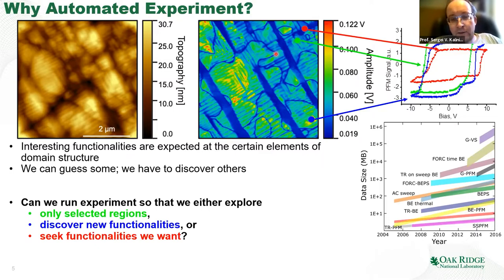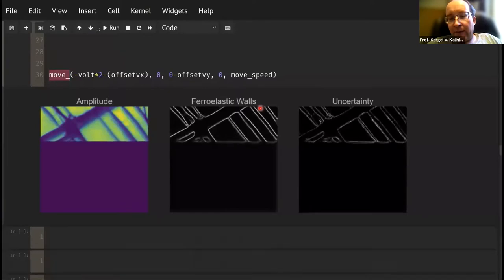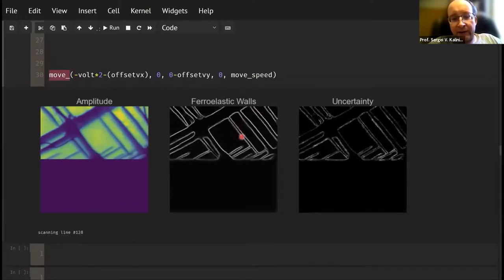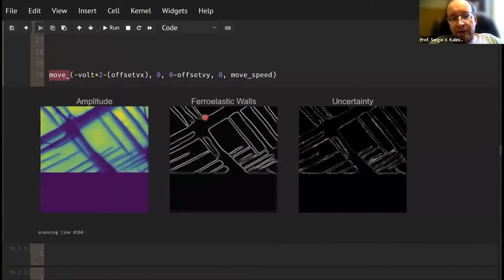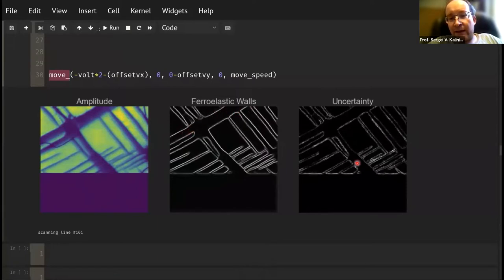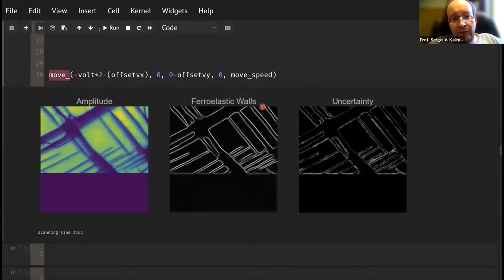The first type of measurement is where we know in advance what structures we are interested in, we tell the microscope to discover those structures in real time, and then we perform measurements on those structure zones. This can be done by supervised machine learning. What you see here is a Python plugin for the microscope that works in real time — it acquires the data and converts it to ferroelastic wall position and uncertainty. You might say this is simple data with just dark lines, but look: this is a ferroelectric wall, and these are ferroelastic. Our neural network finds only ferroelastic walls and ignores the ferroelectric one, which is also a dark line. So it's not as simple as it looks.